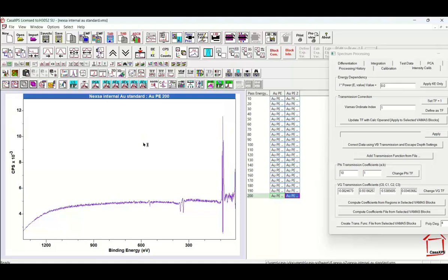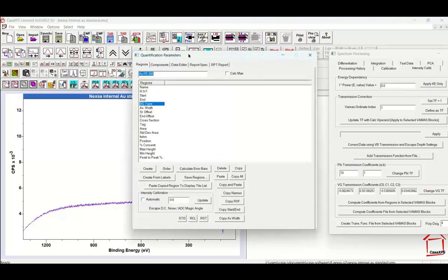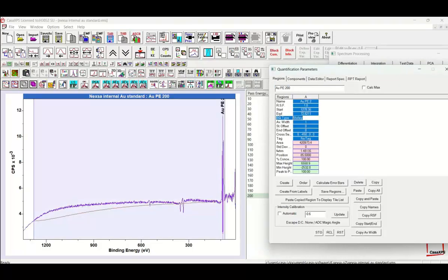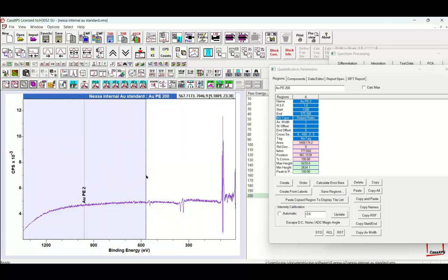That involves eliminating the part of the spectrum that is influenced by the peaks. And I can do that by creating regions. Let's just set a background type that will not interfere too much with the visualization of what's happening. So I'm going to identify different parts of the ratio of spectra that I think are well behaved and away from peaks. So that's my first region. And let's try and identify another region.